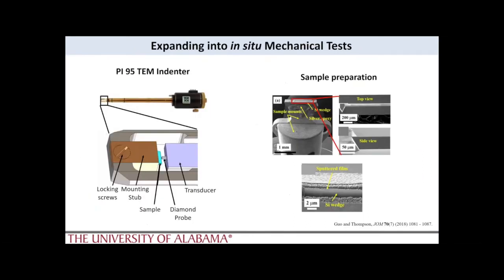So with that, I want to move into what this talk is really about for the rest of the session, which is the use of PED in cross-correlative microscopy techniques and, when possible, its use in in situ TEM experiments. The first one I want to share with you is some work that we did, again on copper, where we indented the sample with a PI 95, well, I guess it's Bruker now, but at the time Hysitron indenter.